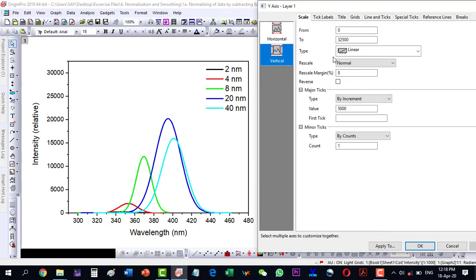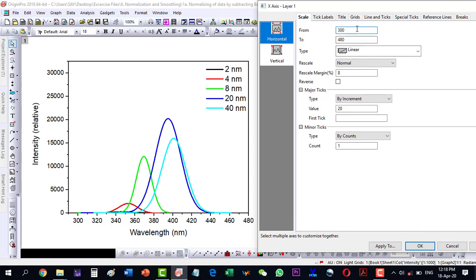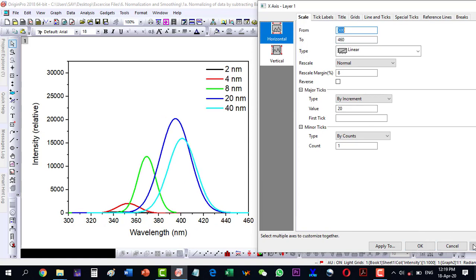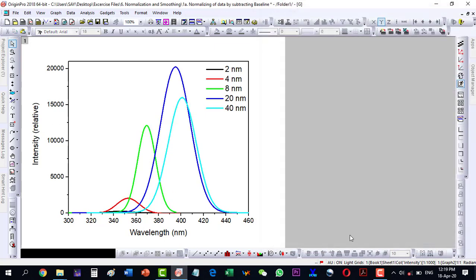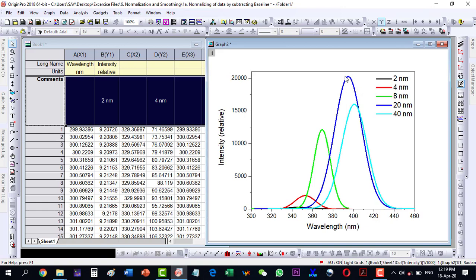Now I rescale the plot. On the x-axis I set it from 300 to 460, and on the y-axis from 0 to 21,000. I apply the changes and we are done with our normalization. In this result, not only the location on the x-axis but also the respective intensities are preserved, so we can remove the background while doing the translation and rearrange our plot in a better way.